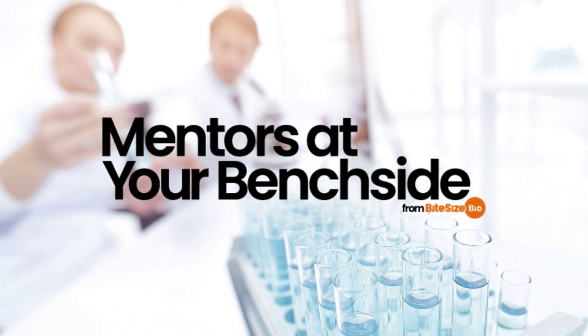One solution is to split, at random, all of the particles analysed into two sets. Then, build two electron density maps and see how well they compare. Great. But this only provides a measure of internal consistency. Estimating absolute correctness is extremely difficult.